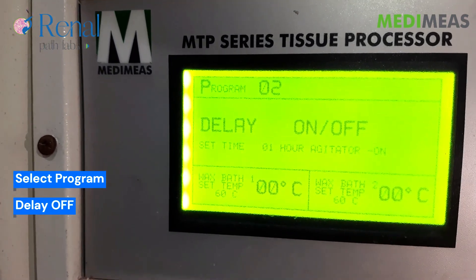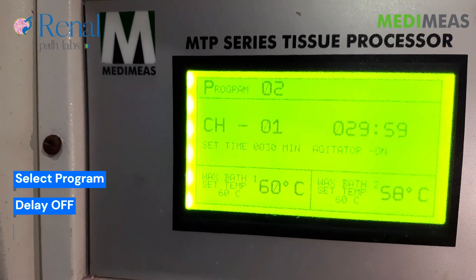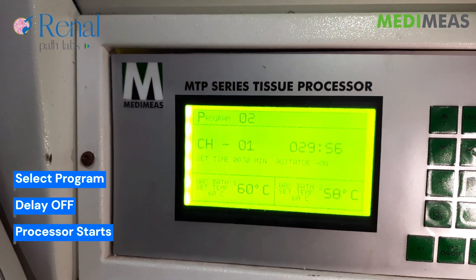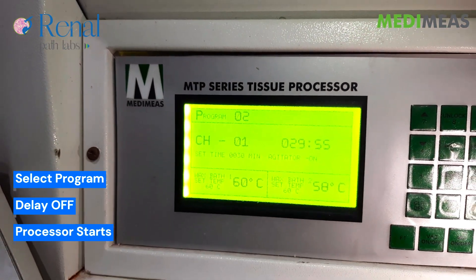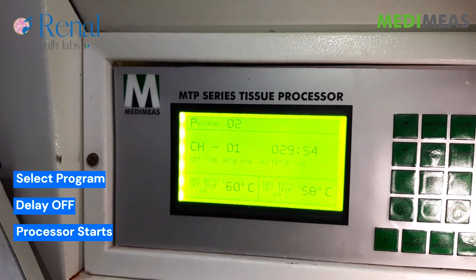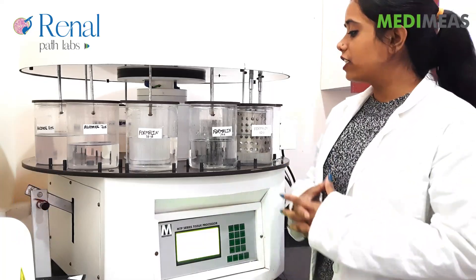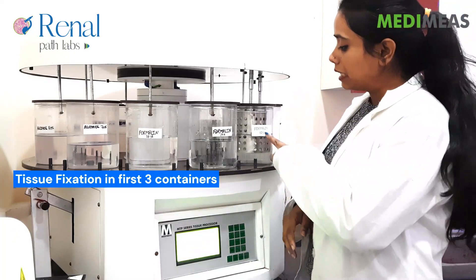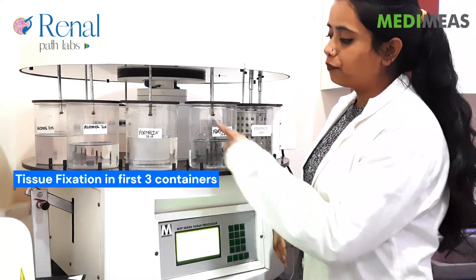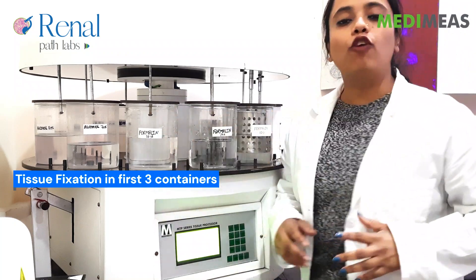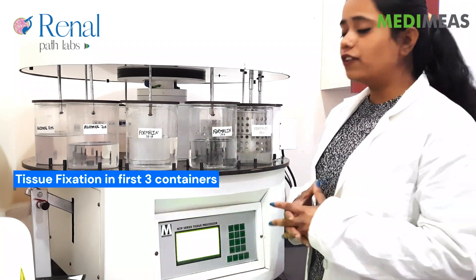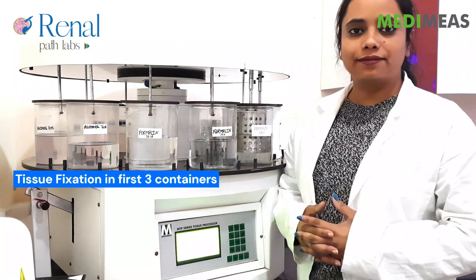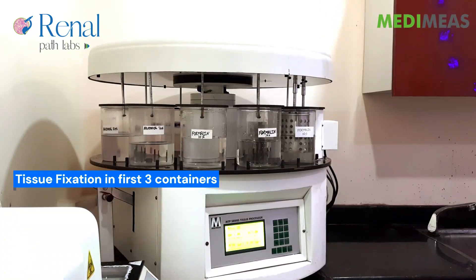Then clear off. Process starts. Now, tissue fixation will be done in fresh 10% formalin containers after 30-30 minutes. Click on start button.